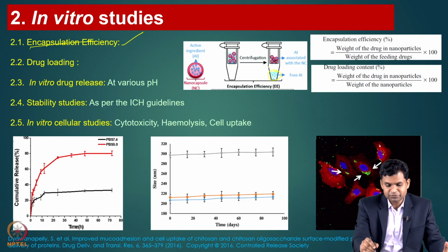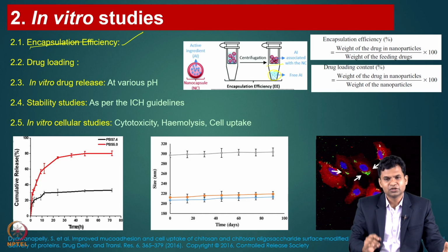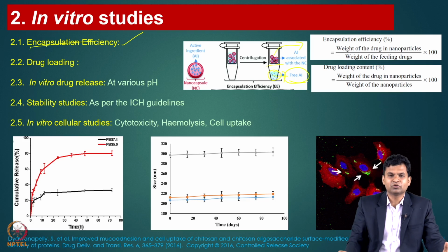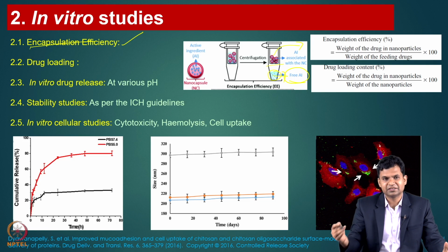They come in different molecular weight cutoffs, so your particles will stay on the filter itself. Later you can remove this outside, collect the liquid, and check the free amount of your active ingredient. Once you are done with this, you can do the calculations.